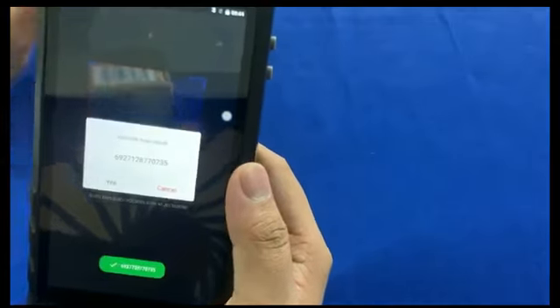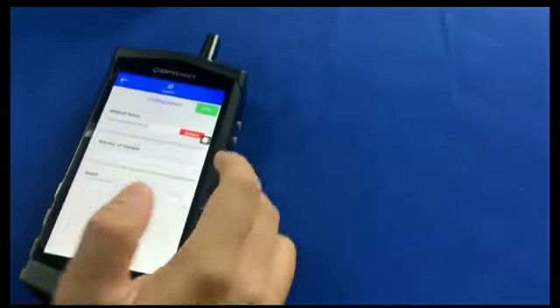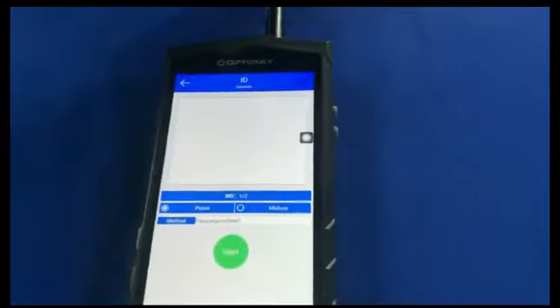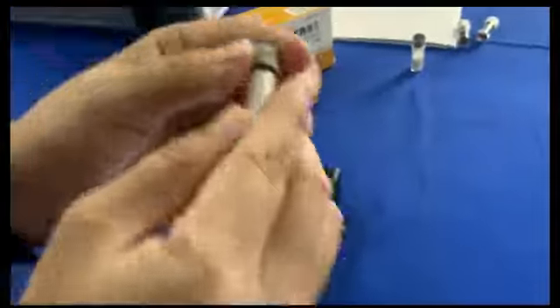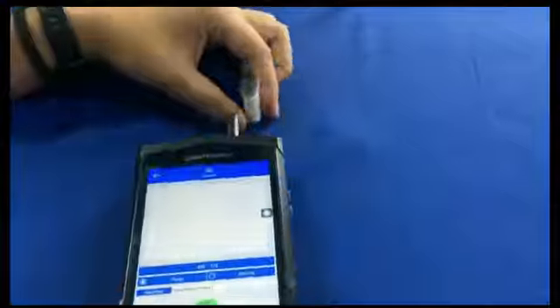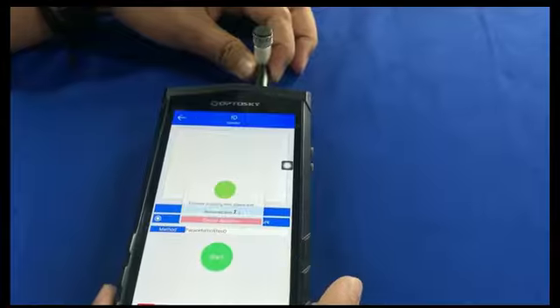And it passed, and you record the HQI and p-value in your protocols. And you can take a picture of the sample you have detected, and you can export a report with the photos. And also you can confirm this test.